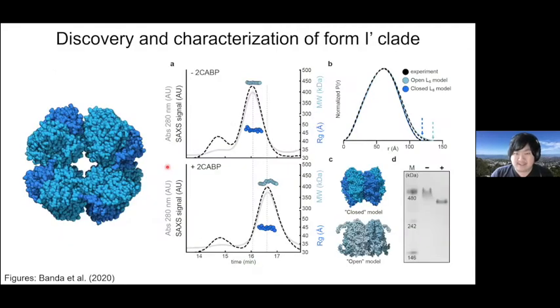And so this is a slide that Mikhail had shown previously that we kind of glossed over, and I'll do so again. But some of the earlier work from our lab with SIBYLS, we identified this metagenomic form 1 prime enzyme is what we ended up calling it. And so this adopted an octameric core without the small subunits capping each of those junctions. And so this had previously been unknown and was thought to be an unstable structure.